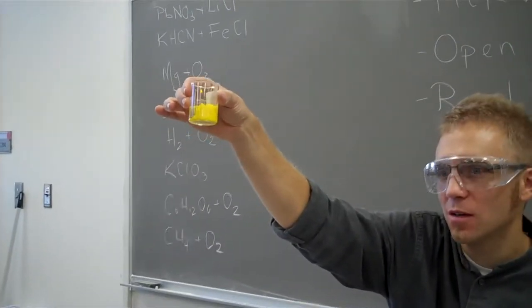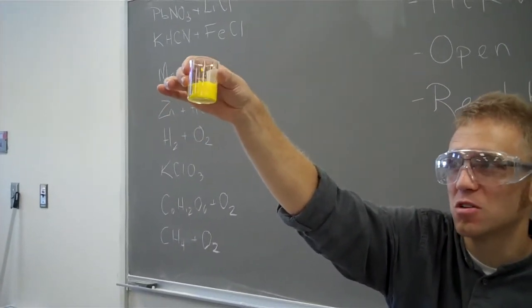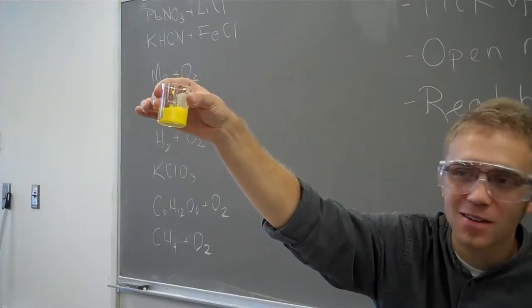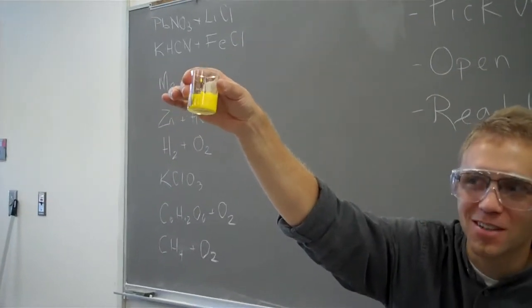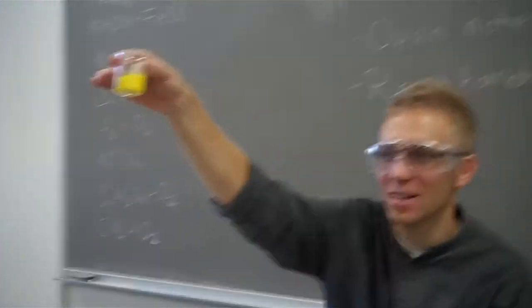Thick, gooey powder called a... thick, gooey powder. What do you call this thick, yellowy, gooey powder? Precipitate. Precipitate. Lead iodide. Precipitate. Lead iodide. That's right.